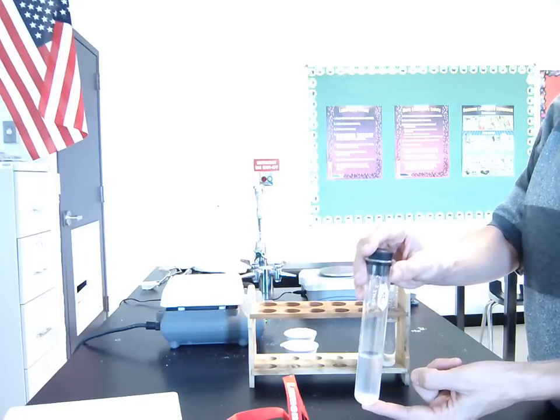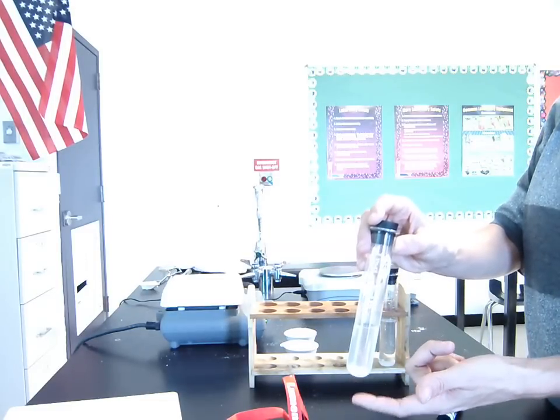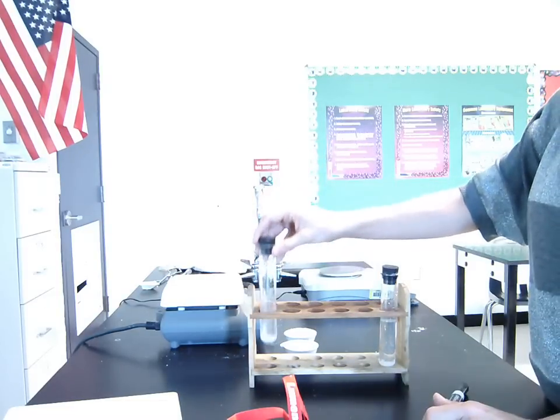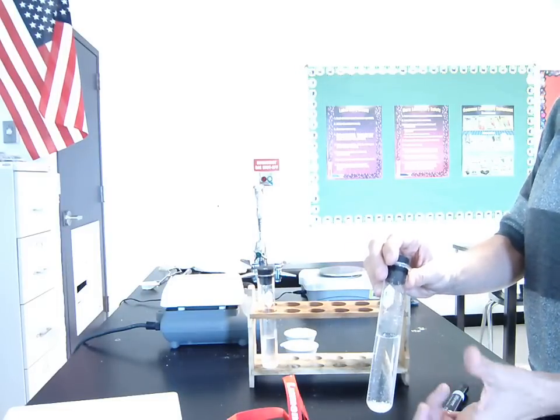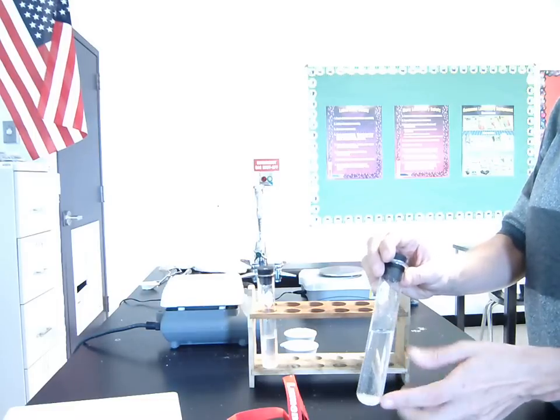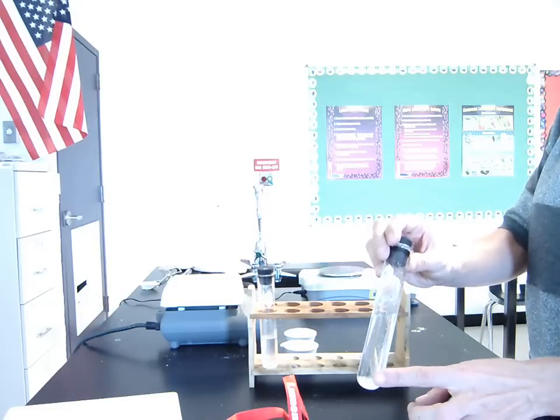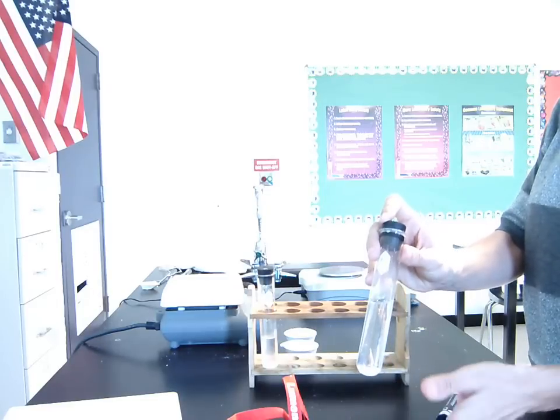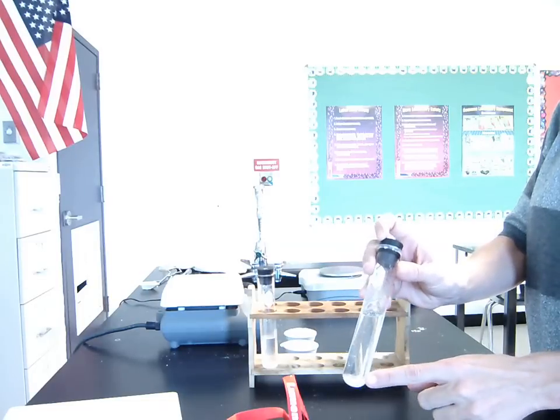So the first part of this is to create saturated solutions. And again, the only way we know it's saturated is when we can physically see that there's leftover solid in the bottom of the test tube that hasn't dissolved. So that one is substance A, and this one is substance B. Probably about the same numbers, no, you know what, there's probably a lot more solid in here. Maybe about 20 to 25 cubic centimeters of water, and 20 to 25 grams of substance is what I had to put in here to get it to be saturated. So again, same thing. I just added a bunch of solid and shook it up and mixed it to the point where no more will dissolve.